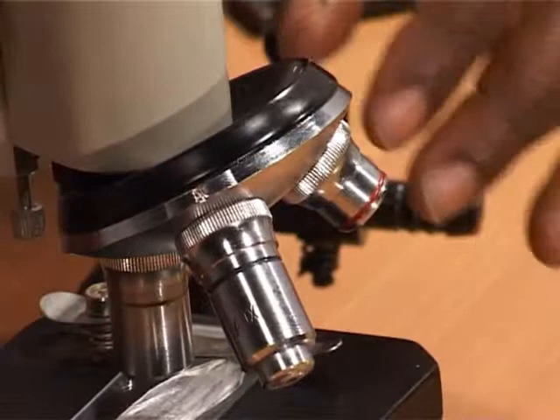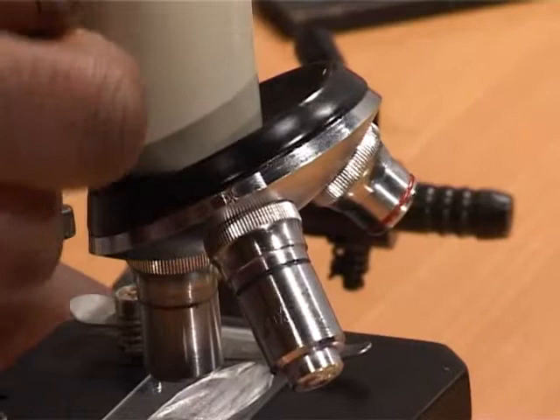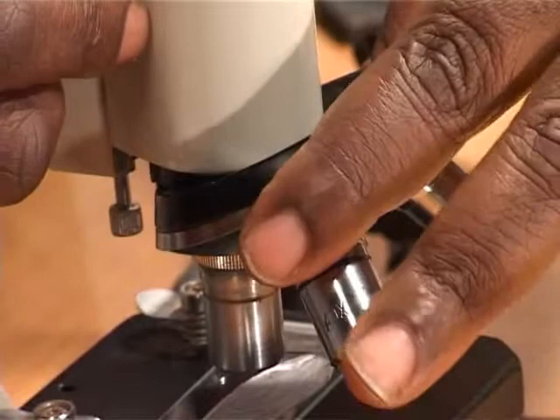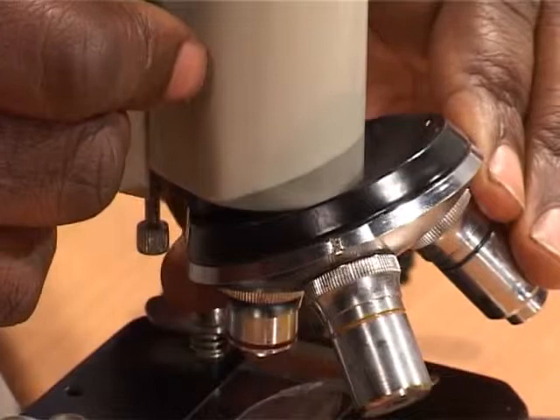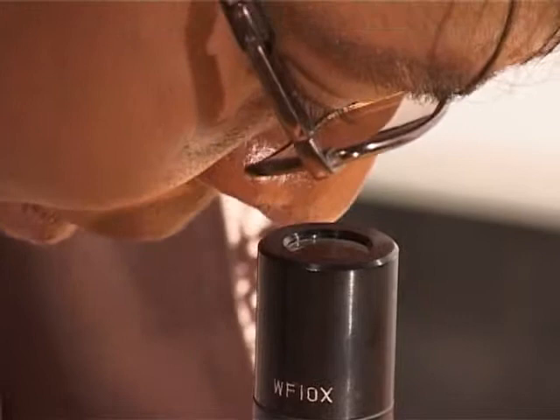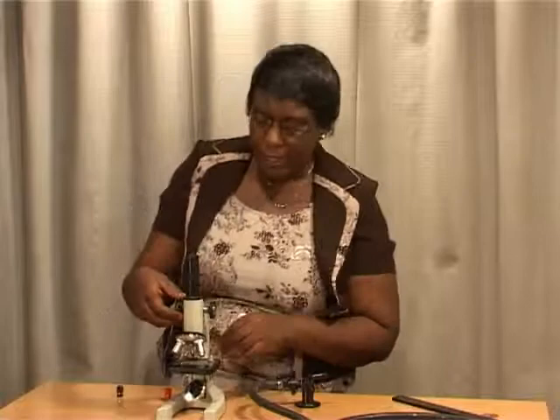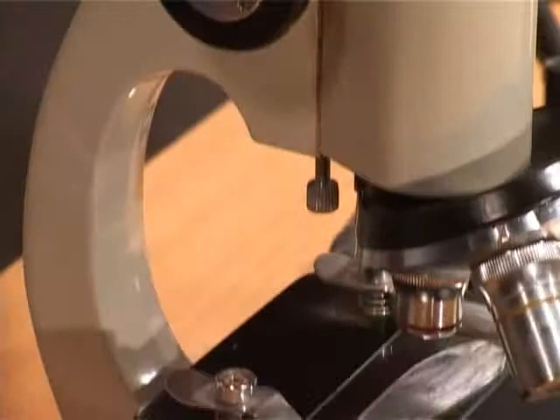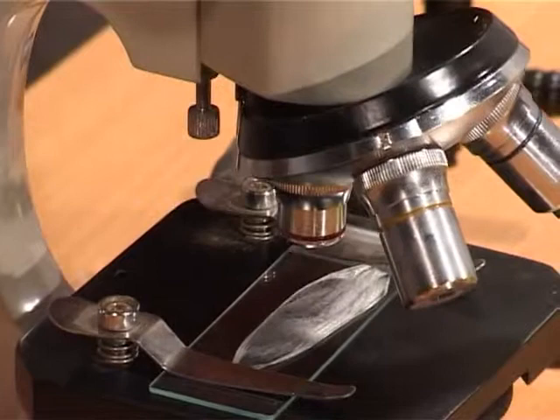Now, if you have not seen clearly, you should be changing the objective lens. We are going to start with the small one, which is 4 times. Okay, let's turn it. You have to turn until you hear the click sound. Okay, and then you start. If you are standing, you can just bend and see through like that. And keep on changing. You are just using the coarse adjustment knob. So when you turn it, it goes down like that. If you want the lens to be lifted a bit, you turn it upward like that.